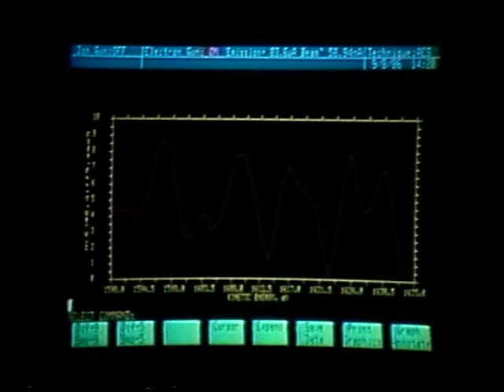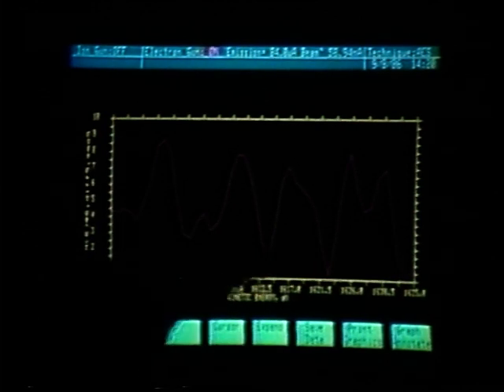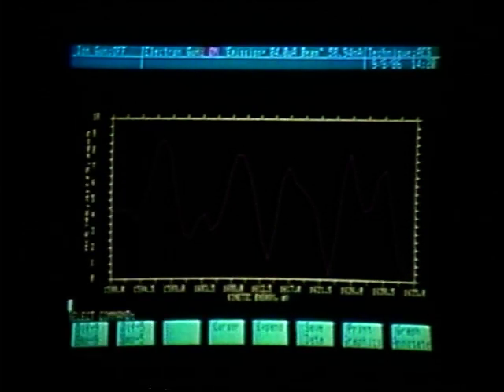Again, the region display is very important in helping us to understand and evaluate our data so that we understand exactly what the computer is measuring. Again, it is measuring the peak-to-peak height, in this instance, of noise level.